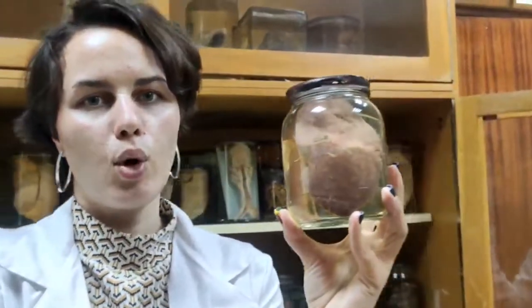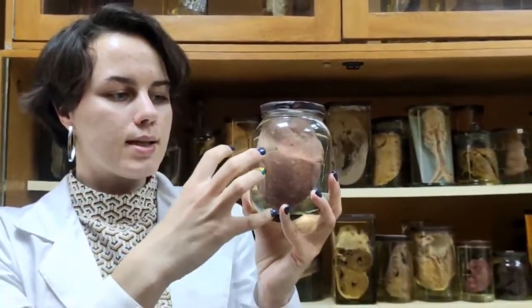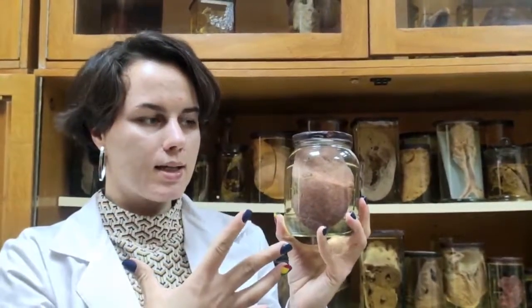That is why it will be more correct if you say acute, because pus exudate is characteristic of acute inflammation. Besides, if it is chronic pyelonephritis, we will see a secondary contracted kidney. I mean that it will be small, shrunken.